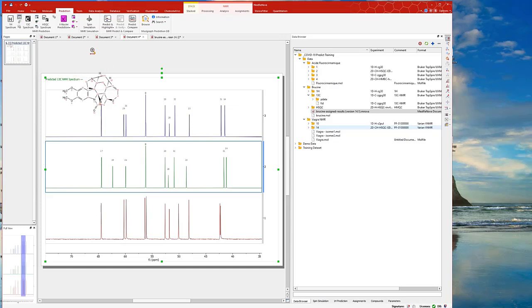Now, the last thing I want to show you very quickly. Sorry, I'm running a little bit out of time, but I'll still keep it within 1 hour. There's a spin simulation here, as you can see.